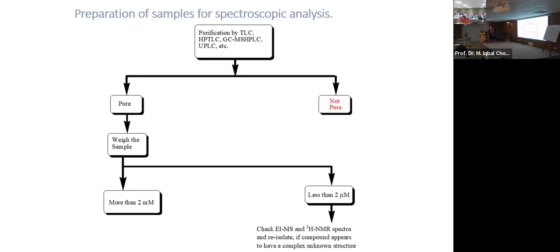We have a limitation in NMR spectroscopy with the available magnet, which is 1.2 gigahertz. We can go up to a 35 kilodalton protein, not more than that. For bigger ones, we still need to rely on X-ray. And now we have cryo-electron microscopy as well, but cryo-electron microscopy just gives the bigger molecular structure overall, not at the atomic level.